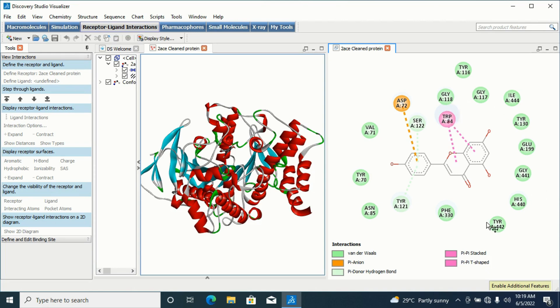The different colors in the 2D diagram represent different bond types. As you can see, this is Van der Waals and this is Pi-Anion interaction — you can identify them from the colors shown in the legend.